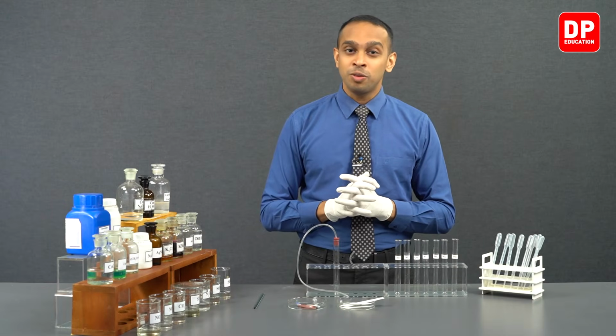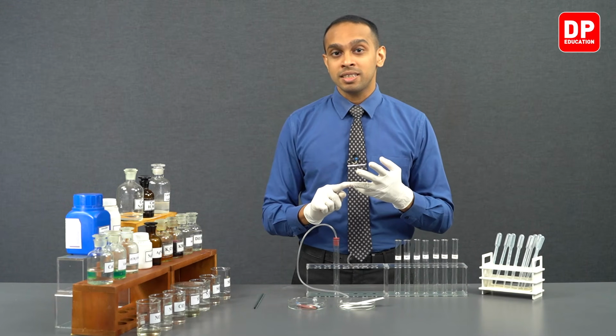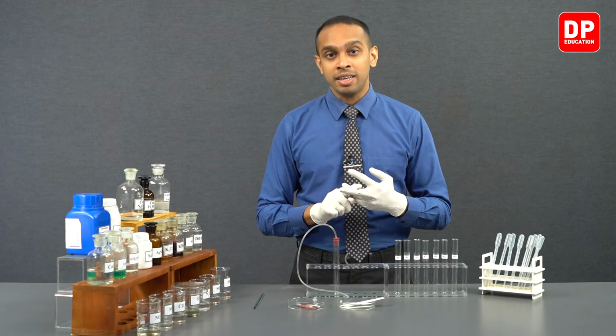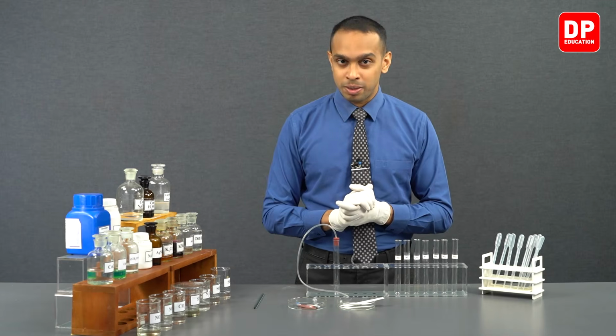After identifying these chemicals and equipment, we can move on to the first set of experiments where we'll be looking at identifying anions or oxyanions of sulfur. Basically, we'll be looking at how to identify sulfate, sulfite, and thiosulfate ions as the oxyanions of sulfur. But apart from that, we'll be observing how to identify sulfide ions as well, S2- ions. So let's move on to that part of our experiment.